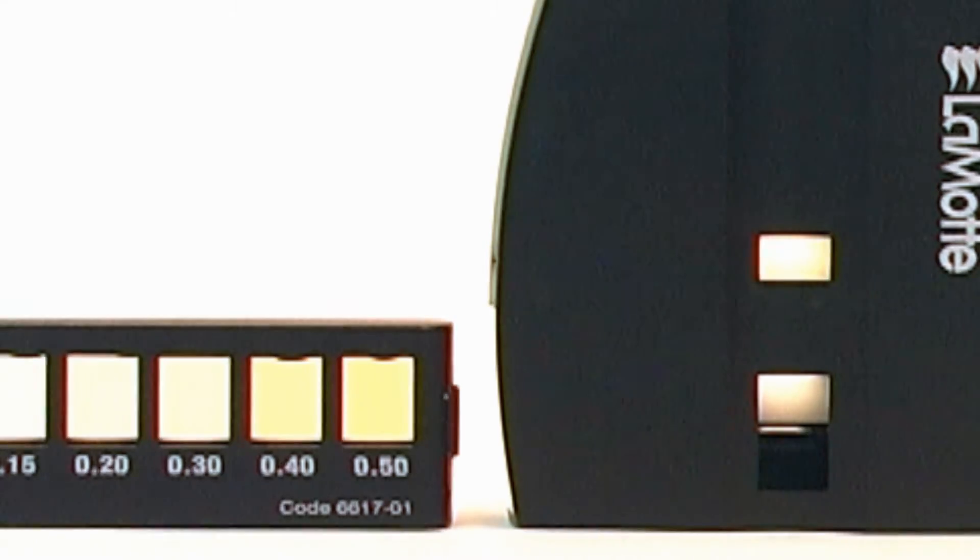The unique mirror configuration in the low range comparator, combined with the sealed glass ampules, makes matching the reaction color of a low range test sample easier and more accurate.